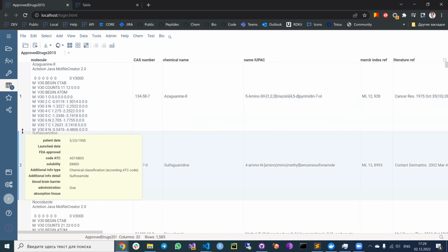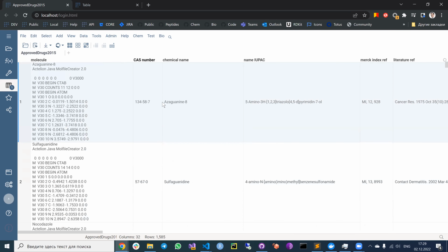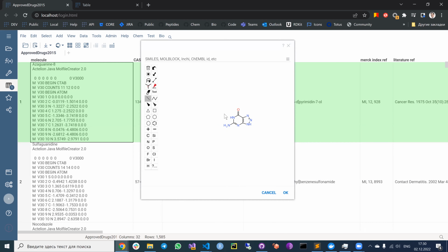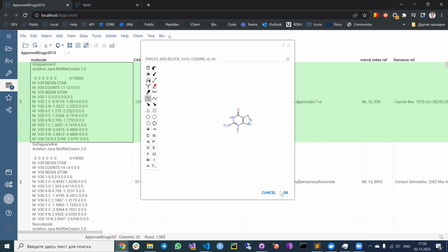By consistency, I mean that if we use any Datagrok feature related to chemistry, it will return the structures again in that original notation. So for sketching, we can modify the molecule, and it will return from Sketcher to this cell as mol v3000.